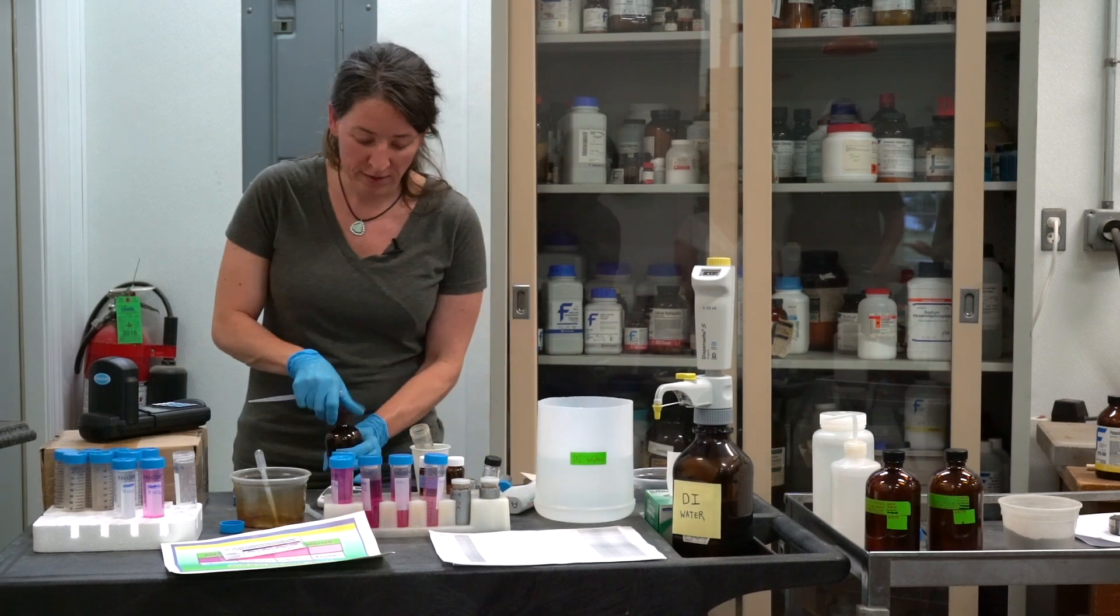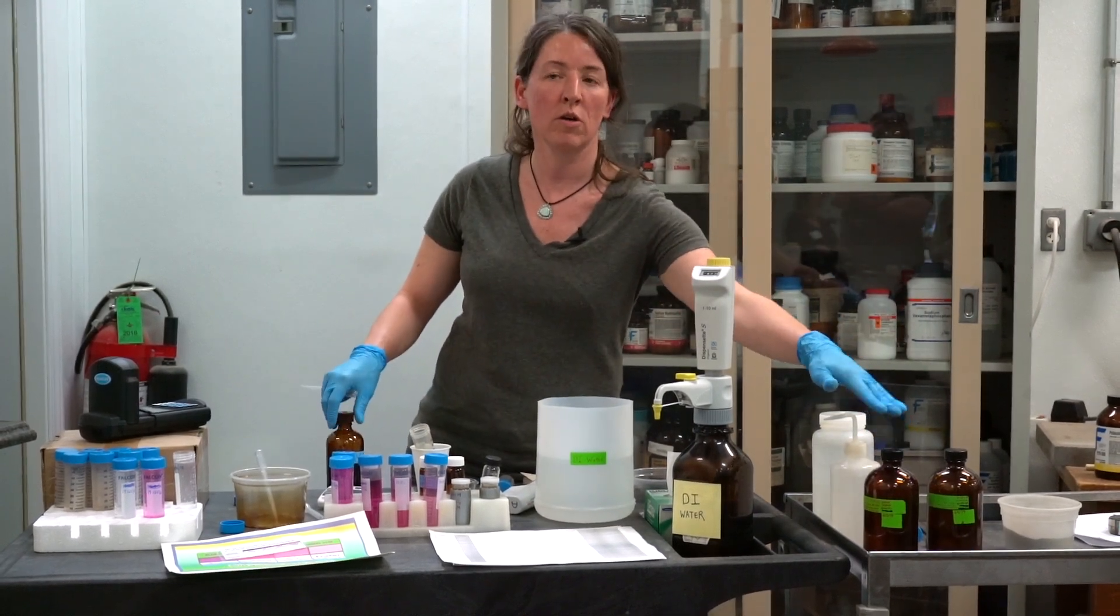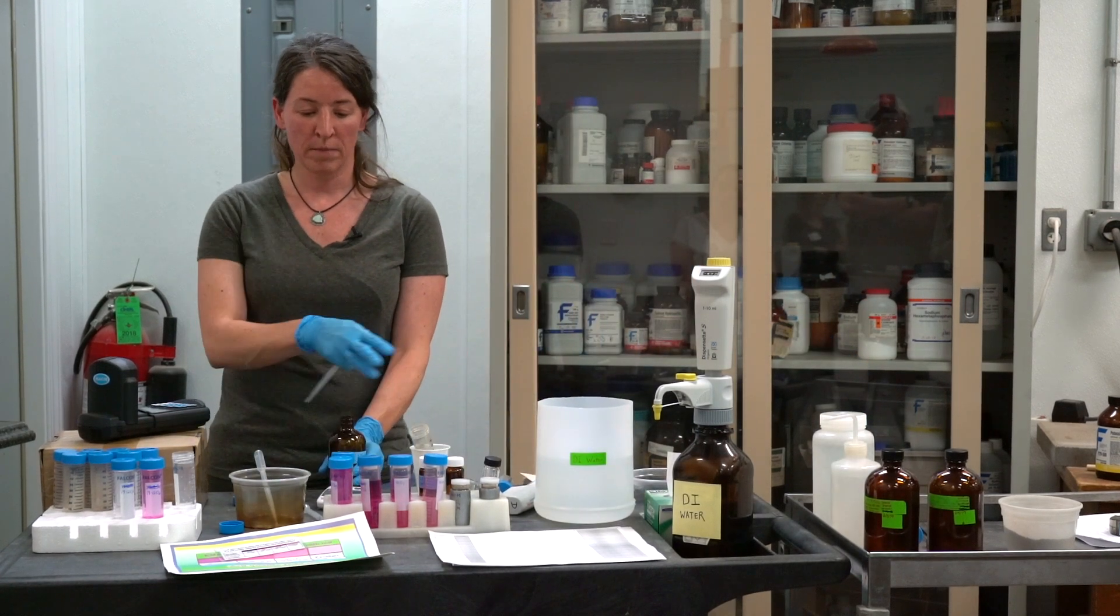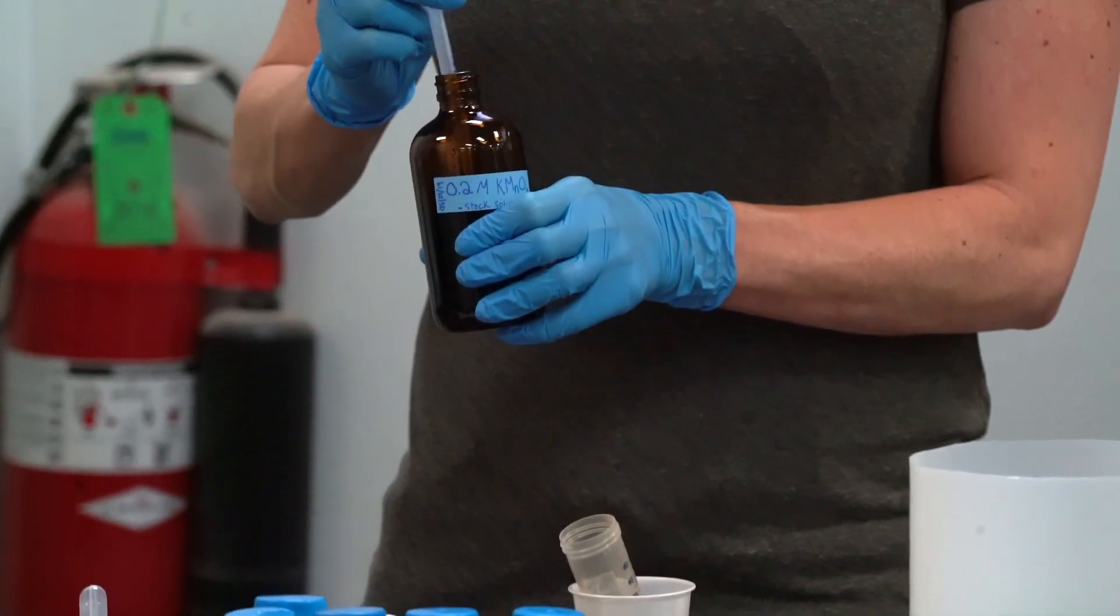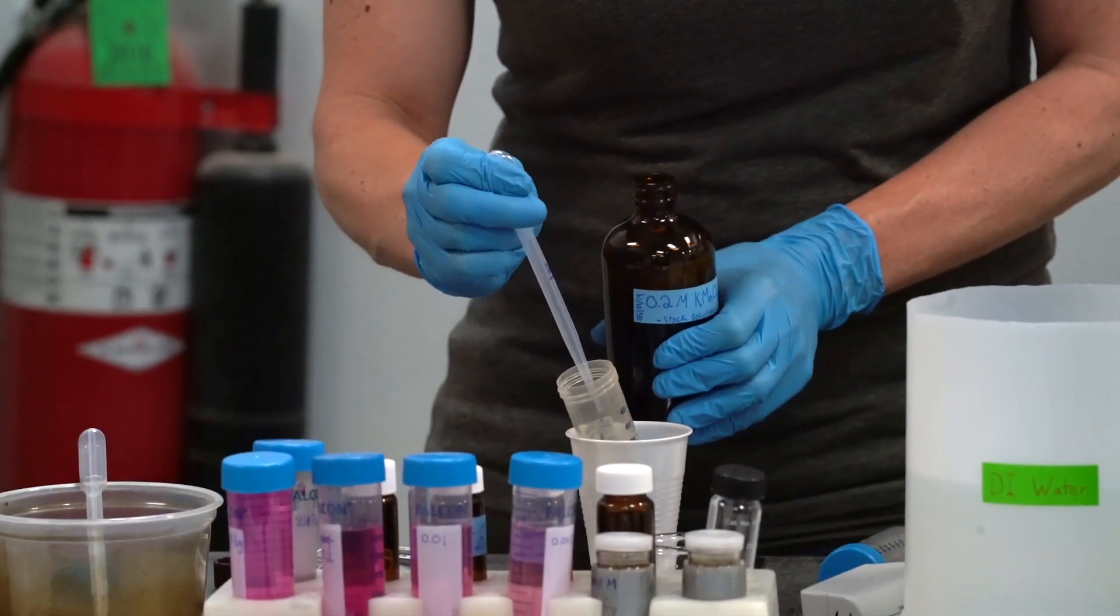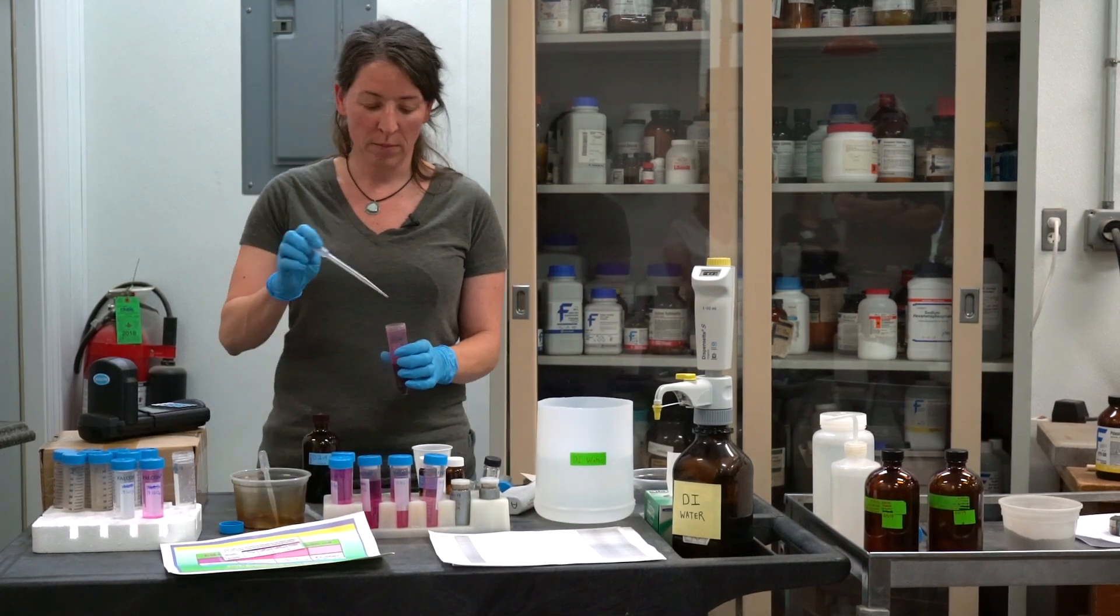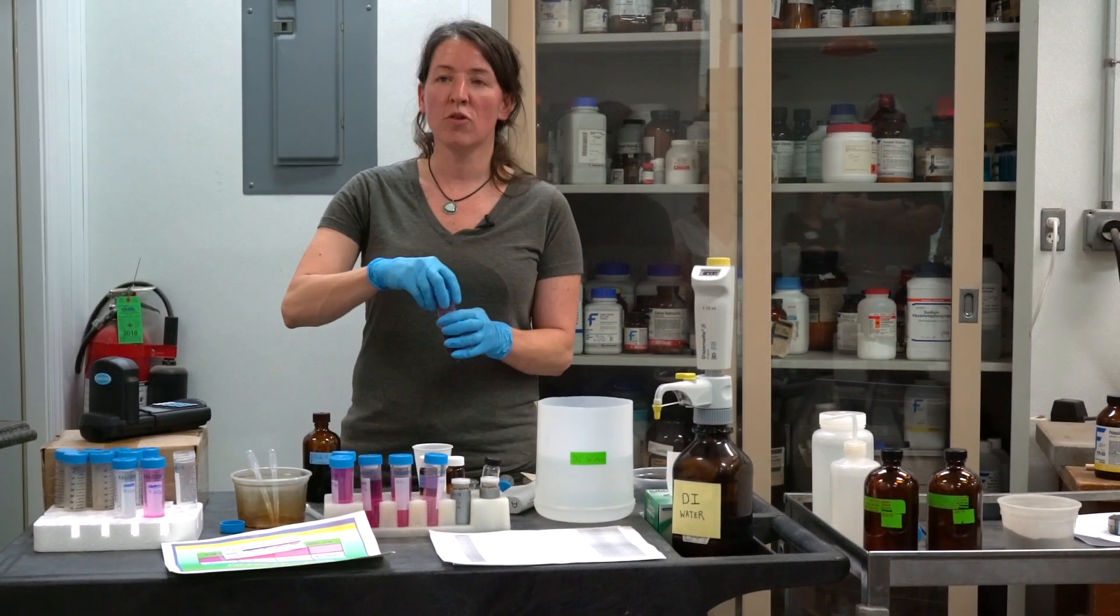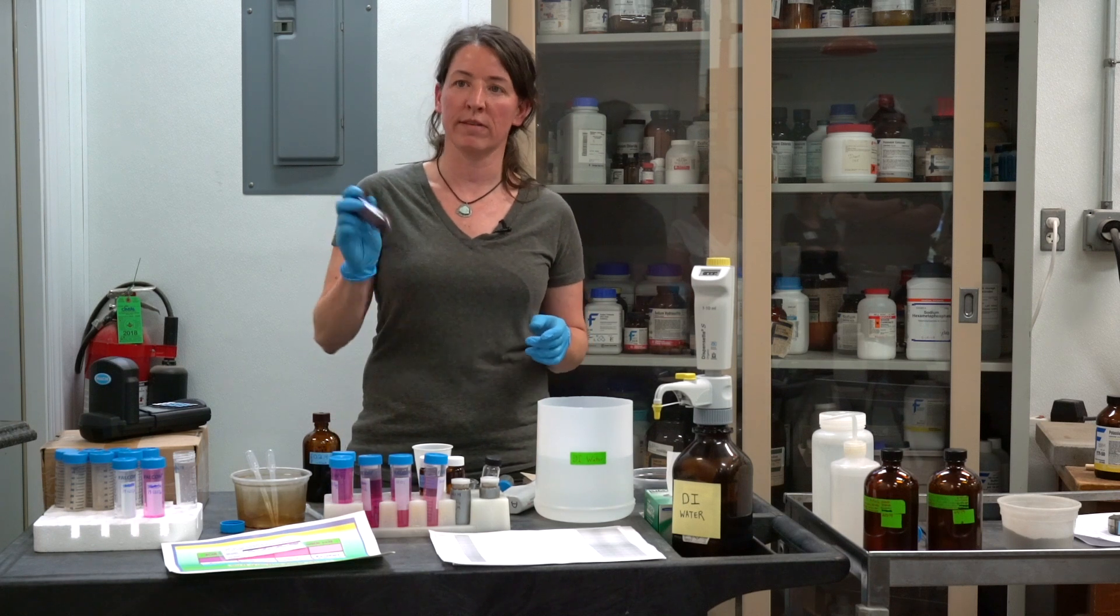On your potassium permanganate, you would have some as a backup with you, but I would keep it cool and in a dark cooler. Then just have a smaller container that you can use and add when you need more. So we're going to get two milliliters, add it. Once you add your two milliliters of potassium permanganate, it's two minutes shaking time. Start your timer for two minutes and shake continuously.